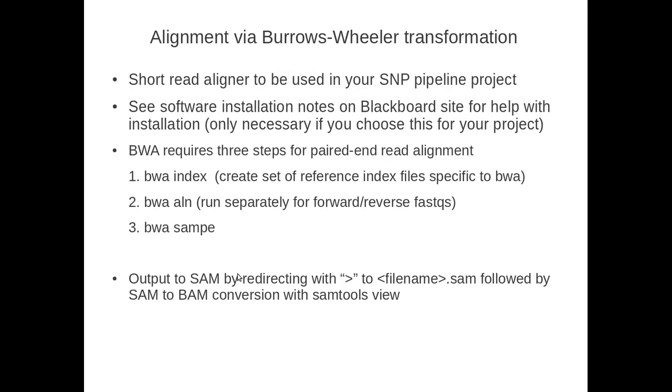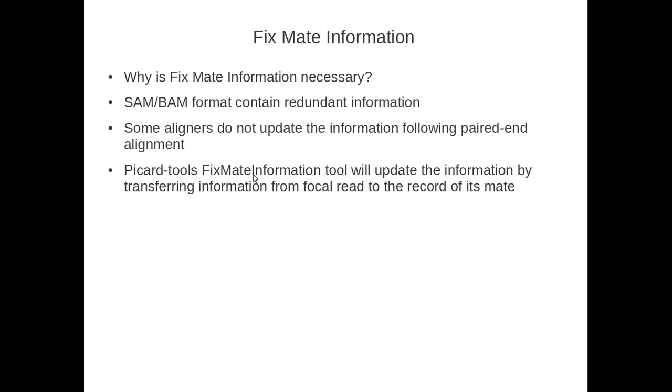For the BWA sampe step, you redirect the standard output to a file name .sam, followed by a SAM to BAM conversion, which you'll learn how to do in your homework. Okay, so keep this in mind. You can come back and review this as you're developing a strategy to complete your SNP calling pipeline.